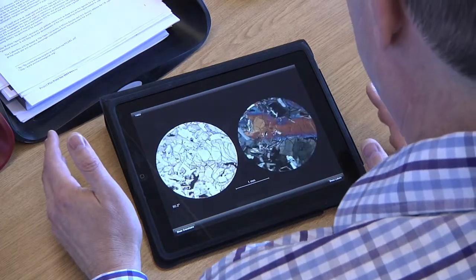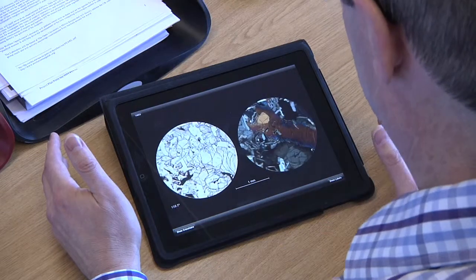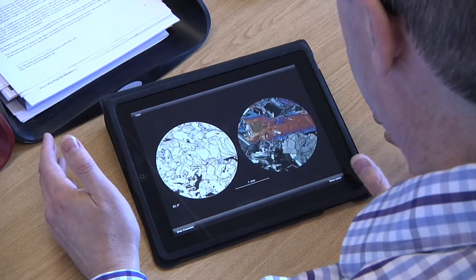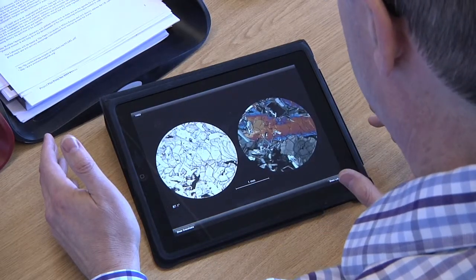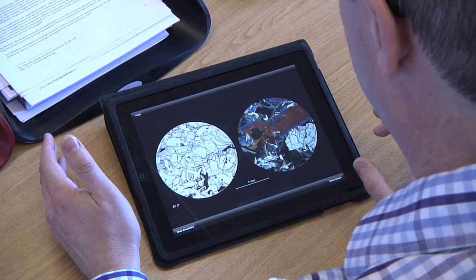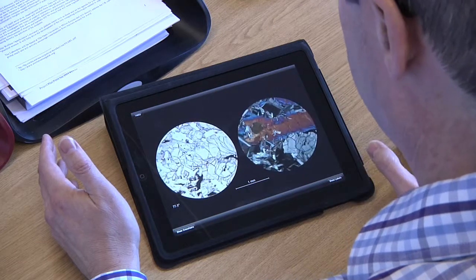It's the cleavage. You can see the cleavage in the pyroxene — it's got long, straight cleavage. And the olivine has that rounded shape and no cleavage. You can see cracks just going across it.